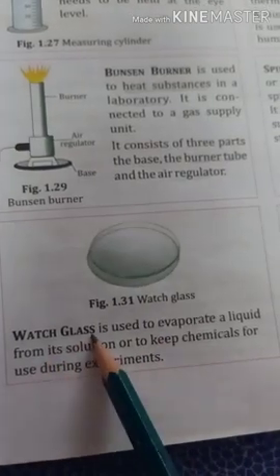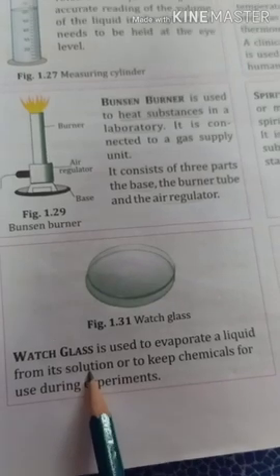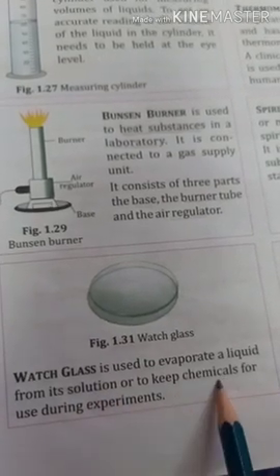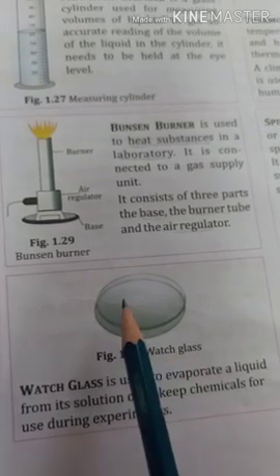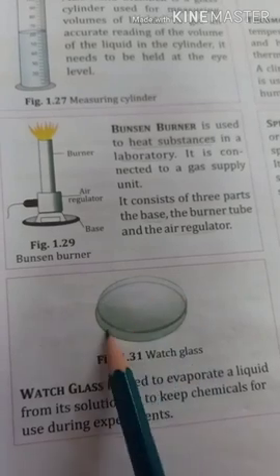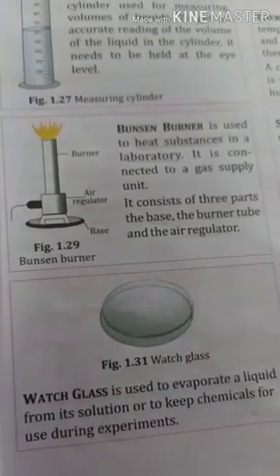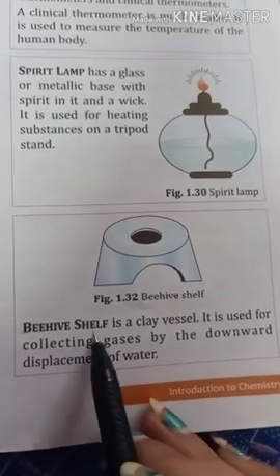Next is the watch glass, and a watch glass is used to evaporate a liquid from its solution or to keep chemicals for use during an experiment. So whatever we want to use during our experiment, we will keep that chemical in this watch glass.